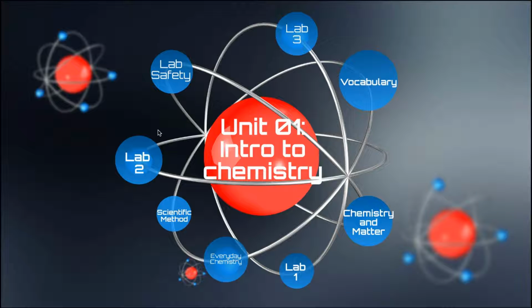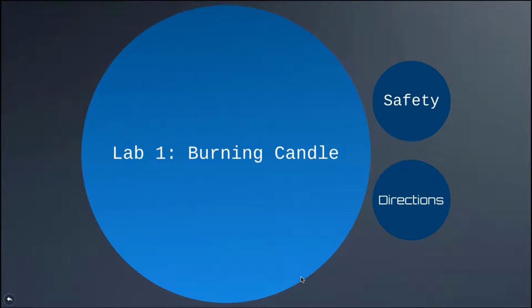All right, so now let's take everything that we learned about matter in that last section, and we'll apply it in a short little lab, just so we can see how matter interacts in our everyday world. And so in this lab, it's very simple, very straightforward. We'll just be burning a candle.